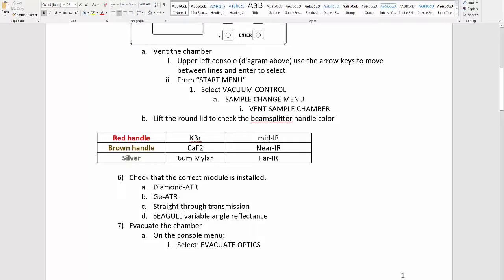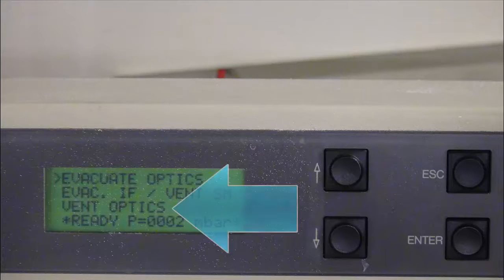The last step you need to take is to check that the correct module is installed. It is standard to use the Diamond ATR. If you did not vent the system when checking the beam splitter, do so now.